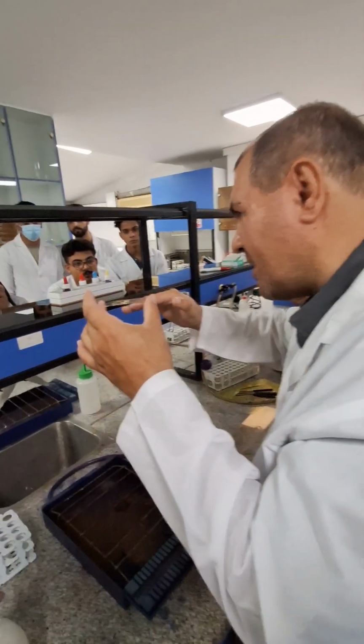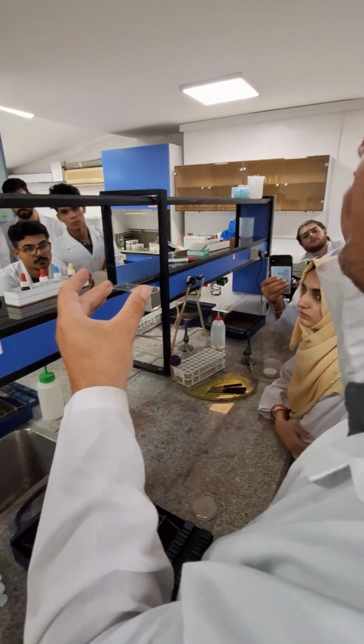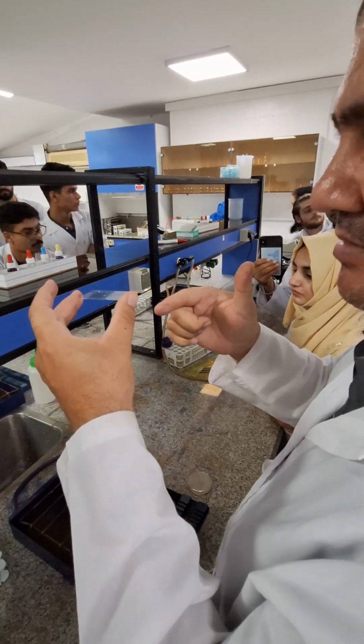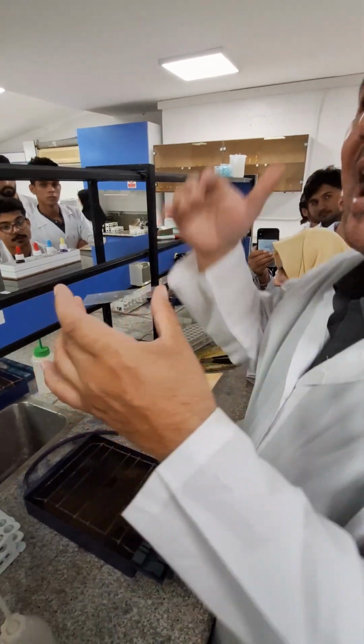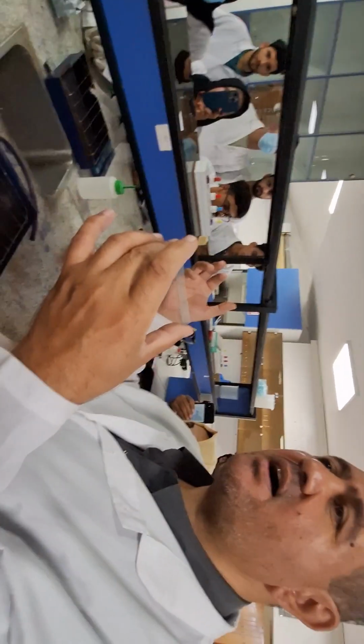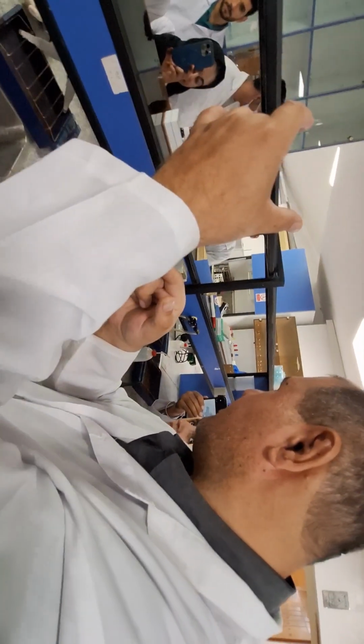We must kill the bacteria before staining. By heating, we kill bacteria, and we increase the attachment of bacteria to the slide. So the aim of fixation is killing the bacteria and increasing their attachment to the slide.